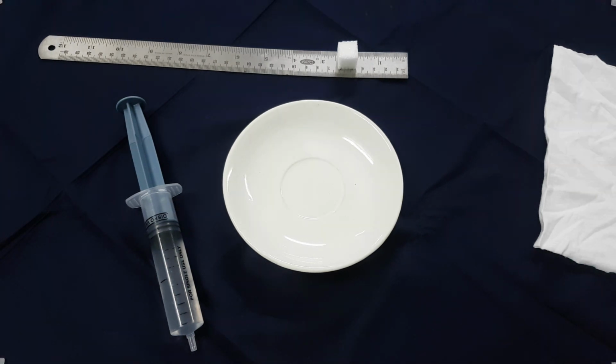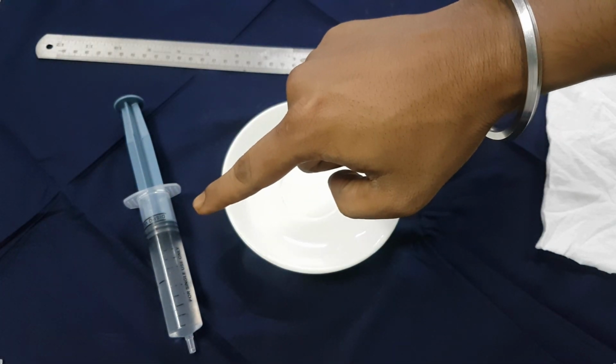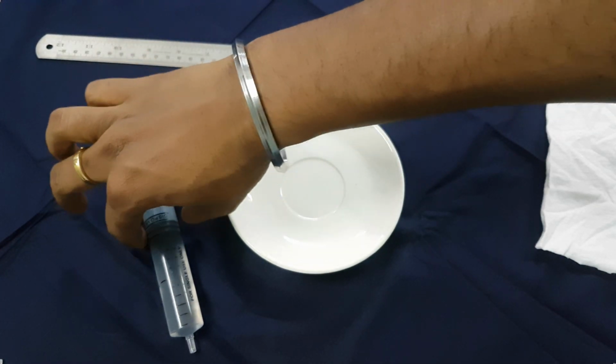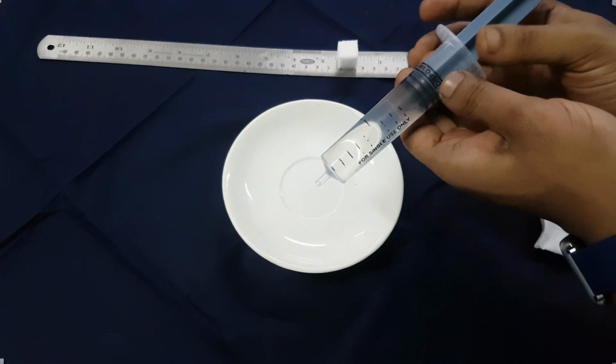Okay, welcome back to the setup, to the experiments. I think this will be my second last experiment. Today in this experiment, we will be testing the solubility of sugar cube in 20 ml silicone oil. Here we have silicone oil already set, ready to begin.